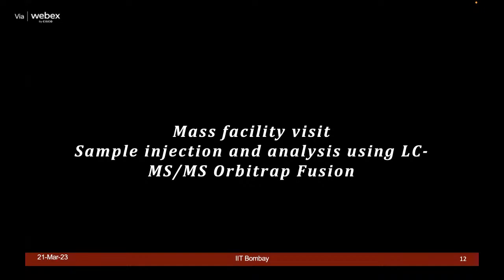Now, how to take these peptide samples, put them in the autosampler in the LC, because first you want to separate the complex peptide mixture into simplified fractions, and you would like to do that in a live online manner using the nano LC, followed by a series of injections directly into the mass spectrometer, so that the complex peptide fractions in different eluates from the LC could be further analyzed with the mass spectrometer.